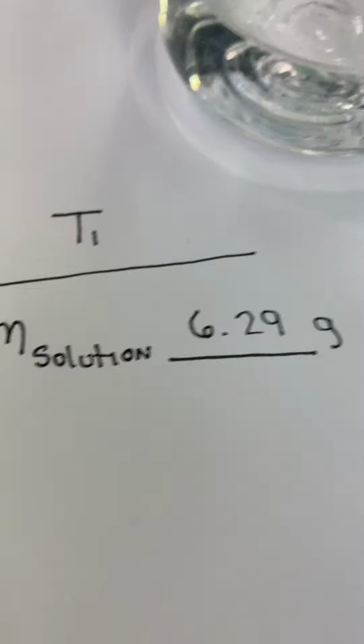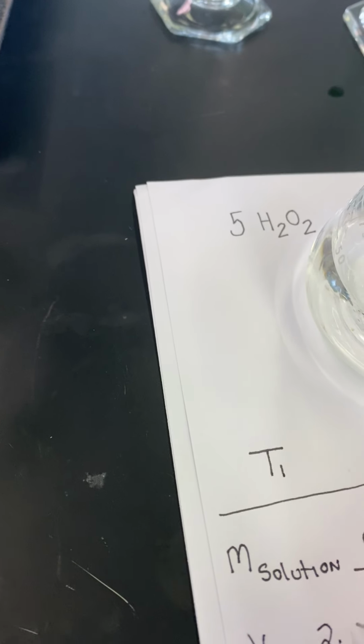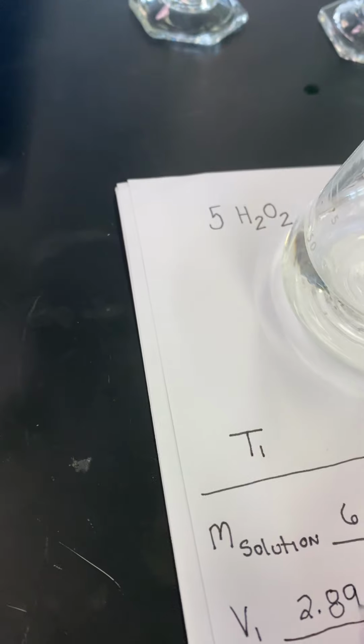Okay, so I'm going to record that on my chart as volume initial, 2.89 milliliters.